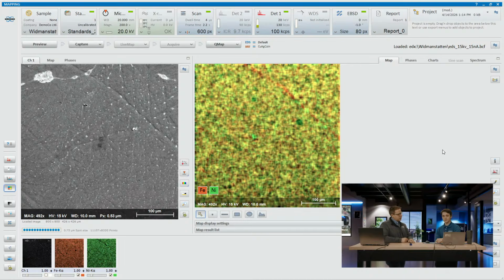All right, so with that, if we check out that screen here on his software, what are we looking at? We are looking at an EDS map of our sample. I don't see any features. Yeah, I would say it's incredibly boring, actually. This is an iron-nickel meteorite. So we're seeing iron and we're seeing nickel. All right. Well, I guess that's the episode of Live from the Lab. Yep, we can get really boring. That's a wrap. So nickel and iron. That's actually good though, because iron-nickel is a very normal composition for meteorites, right?